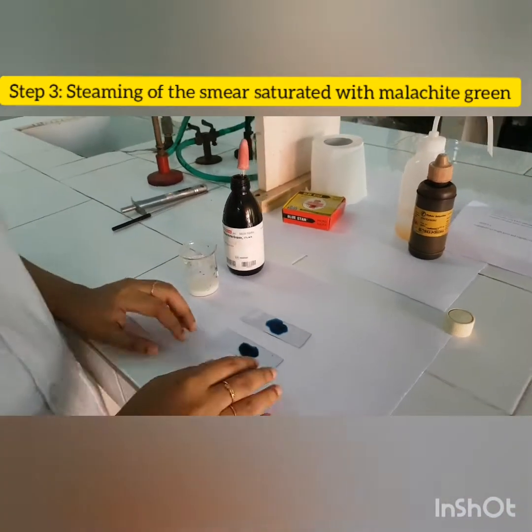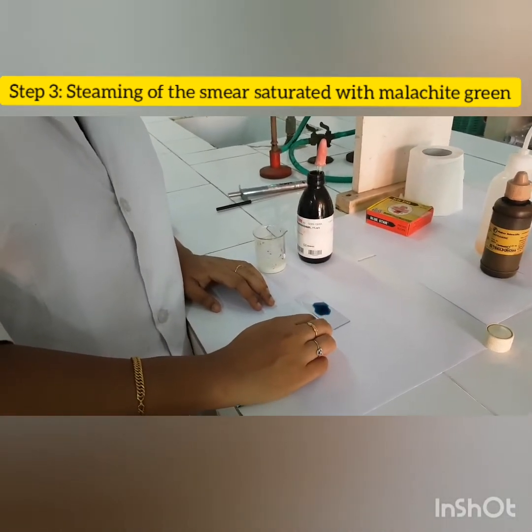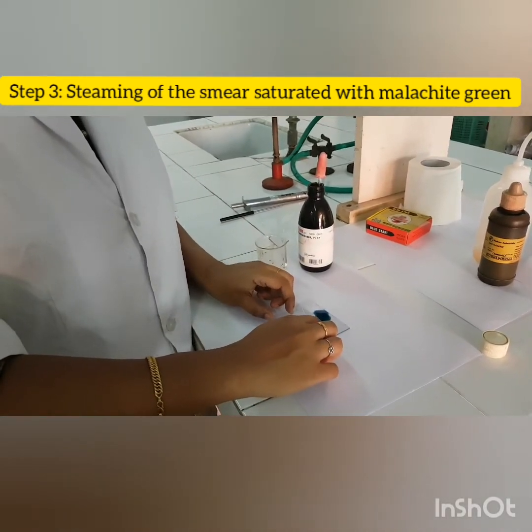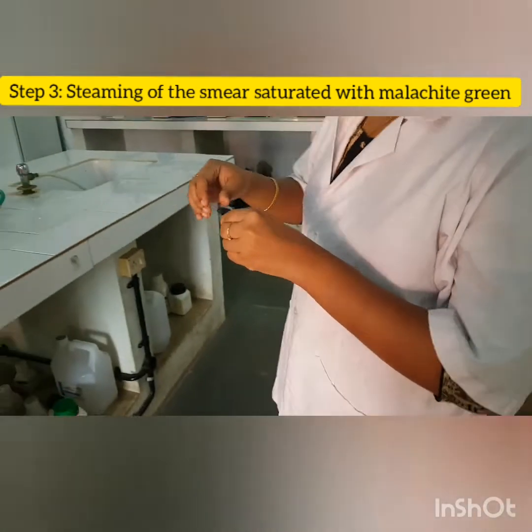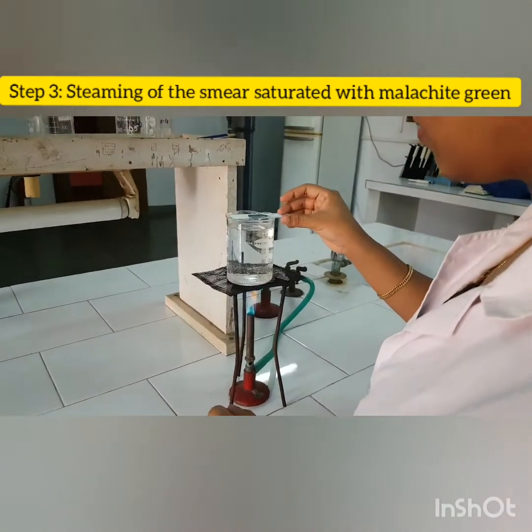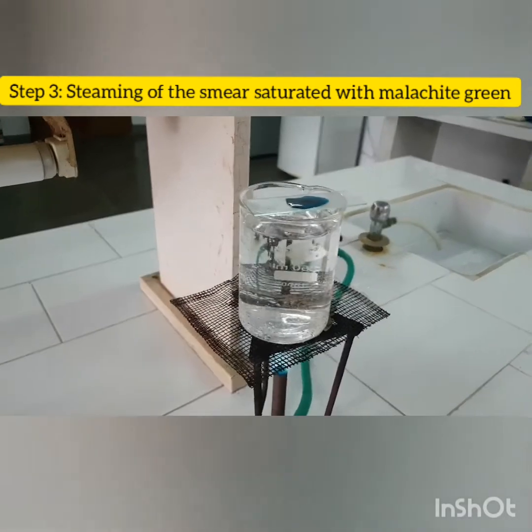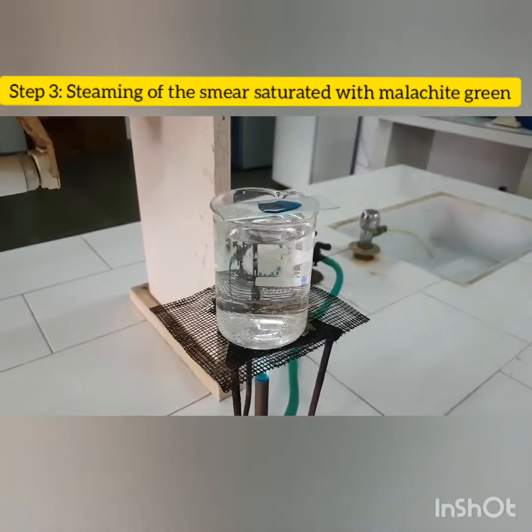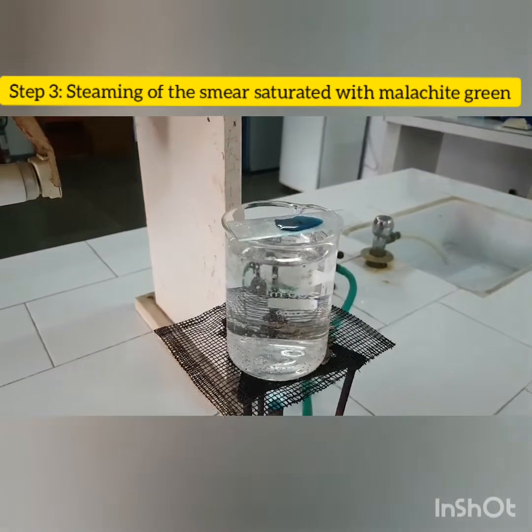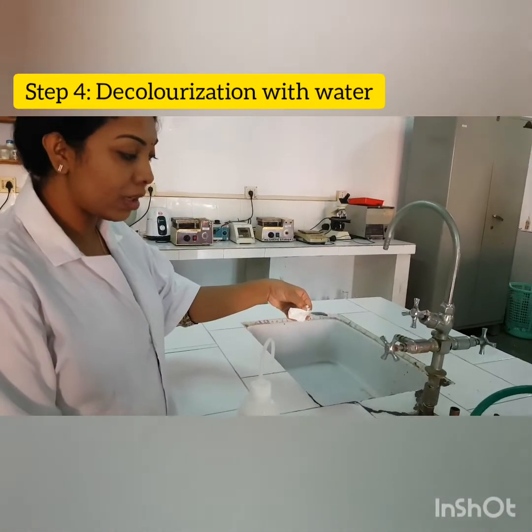After saturating the slide with the stain, we have to give steam for almost 5 to 10 minutes. So for that, we can place it over the steam and give the steam for almost 5 to 10 minutes, because this steaming acts as a mordant so that the malachite green will be forced into the endospore. This is the steamed malachite green stain over the smear.